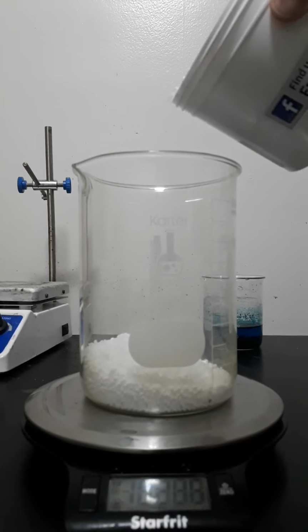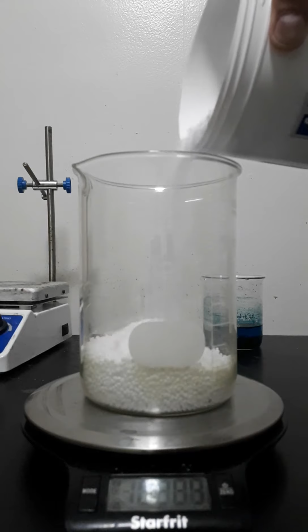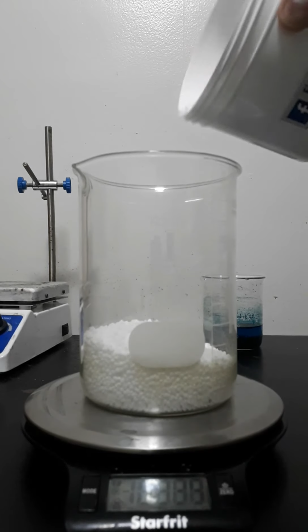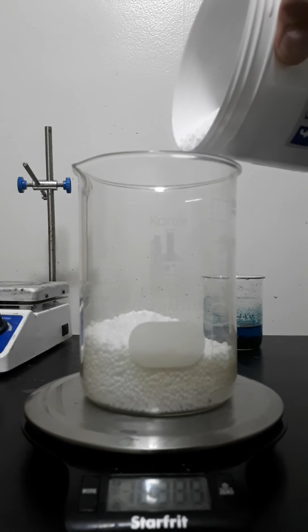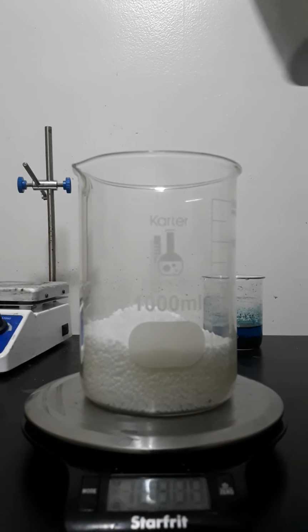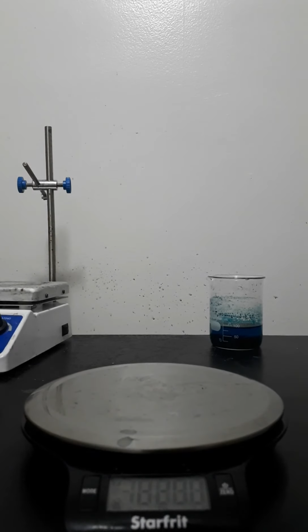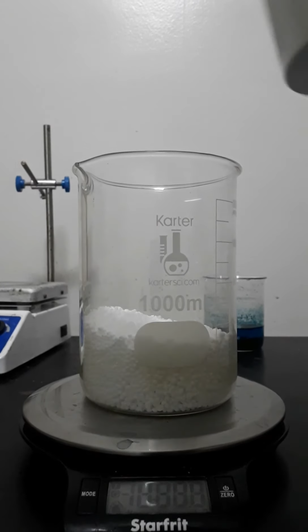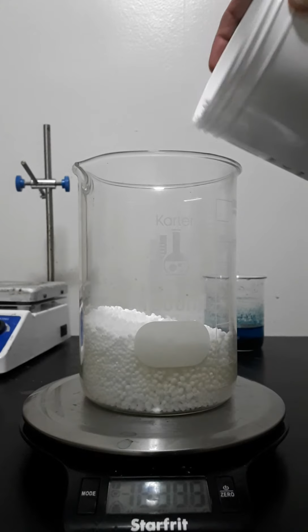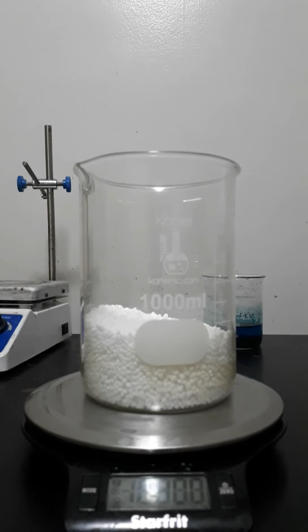The way I purchased it is that I found some vendor in Quebec and I purchased it from him. I purchased about 2 pounds of this. Okay, that was a little bit too much. Okay, seems to be about, yeah, that's exactly 400 grams.